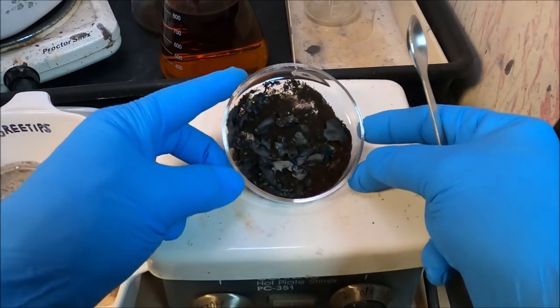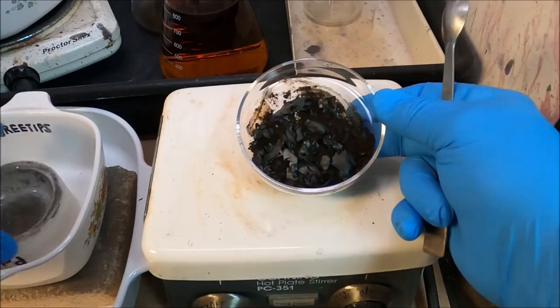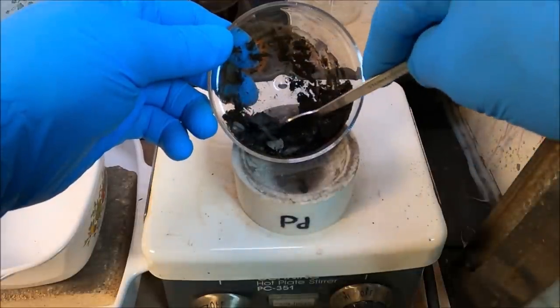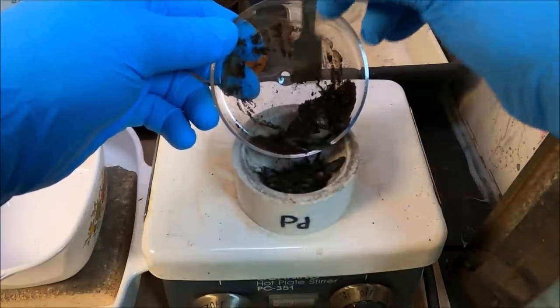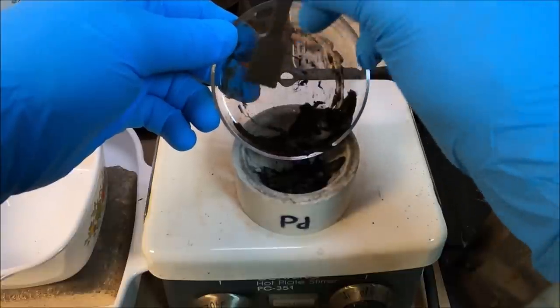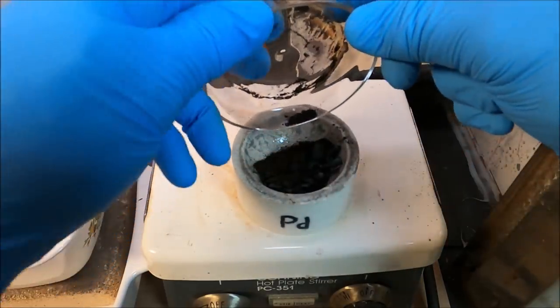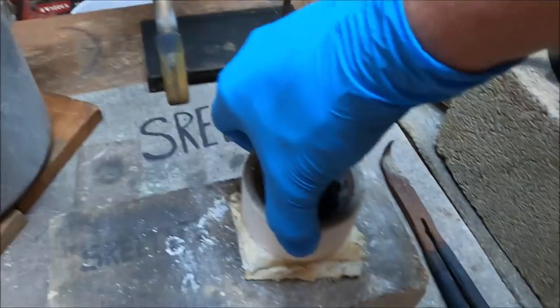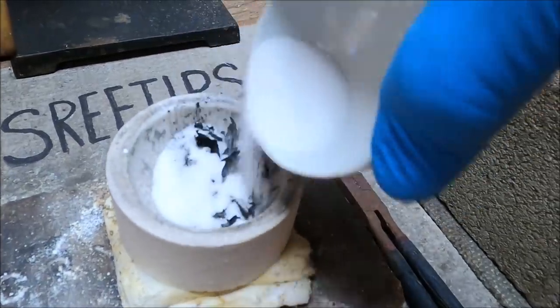Here's our palladium metal - you can see it's in a powdered form with some ash mixed in, but that's quite all right. I'm going to transfer this to this crucible here, then get it over on the melt table and get it melted up into a button. Now we're going to put it on the melt table and cover it with some borax so we don't blow that powder out of the melt dish when we put the flame to it.